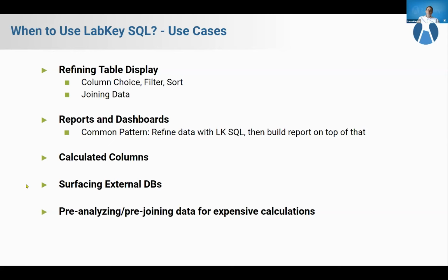Also, if you want to work with calculated columns, LabKey SQL is a great way to do this in the server. We're going to do some more work on this next year, as Adam pointed out, but right now, calculated columns are something that you do inside of LabKey SQL.